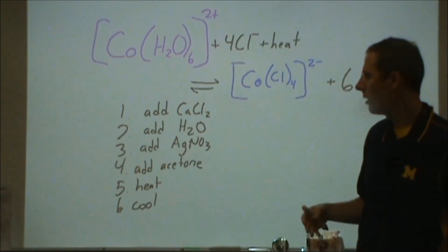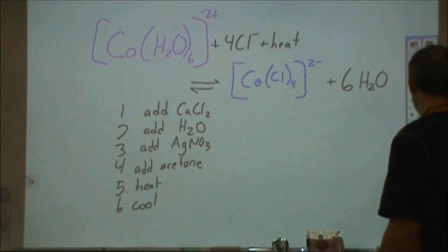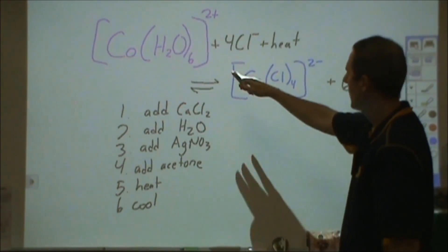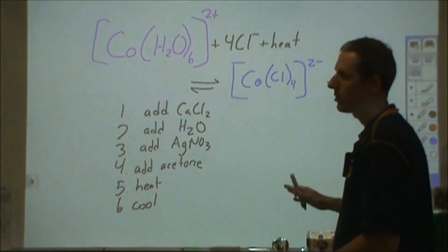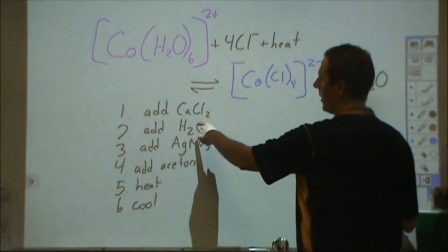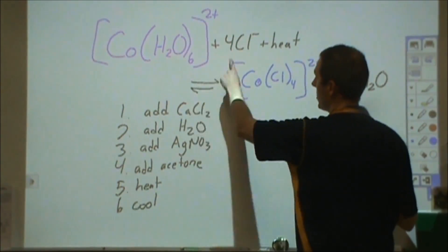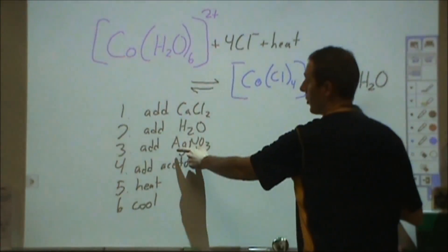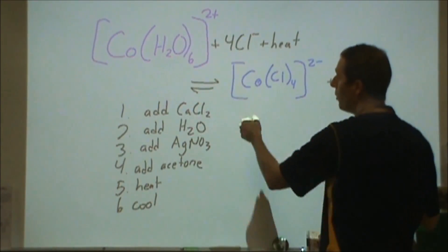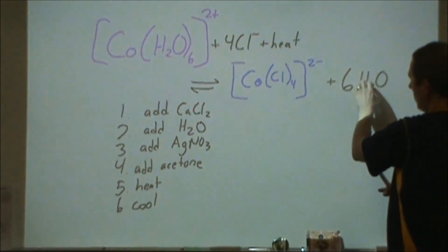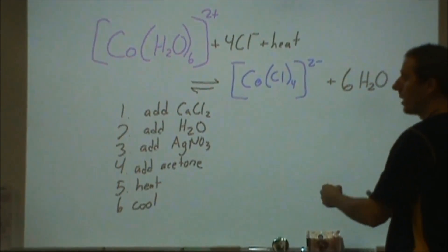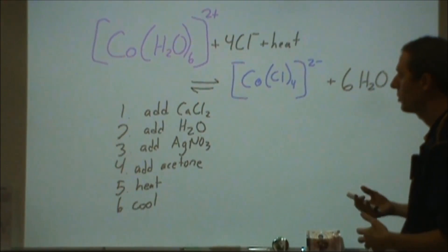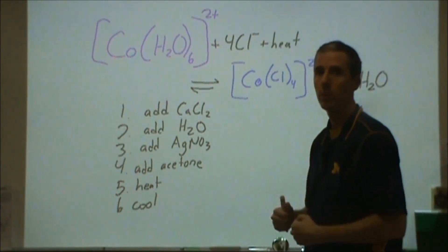What we're going to do is show some Le Chatelier principle demonstrations where we're going to add various features to this mixture. In the first one we're going to add calcium chloride which is a source of chloride ions. The second one we're going to add water. The third we're going to add silver nitrate which is going to remove chloride ions. And the fourth we're going to add acetone that's going to remove water. The fifth we're going to add energy, thermal energy. We're going to raise the temperature. And the sixth we're going to reduce the temperature.